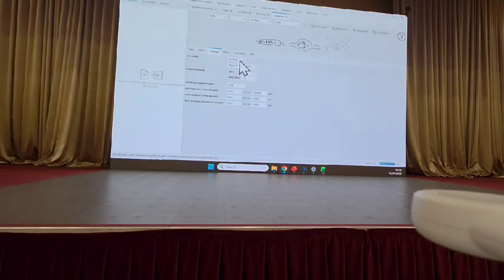So we're just going to keep this no filter. You can set it to positive if you want positive. You can set it to negative if you want negative. You can keep it no filter. Mzmine will detect it on its own. We analyzed our data in positive mode. I forgot to mention that before. I just keep it no filter. Mzmine does a great job detecting on its own.